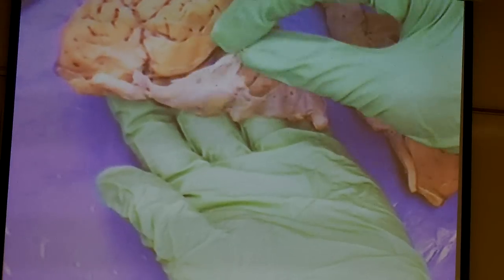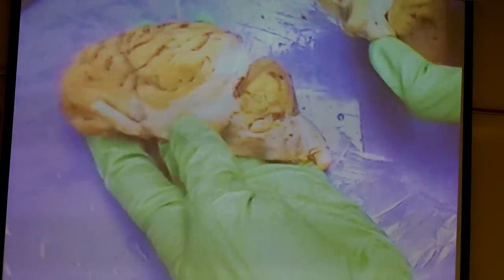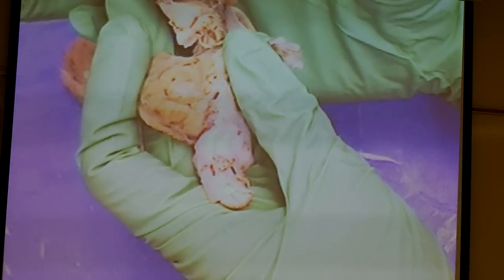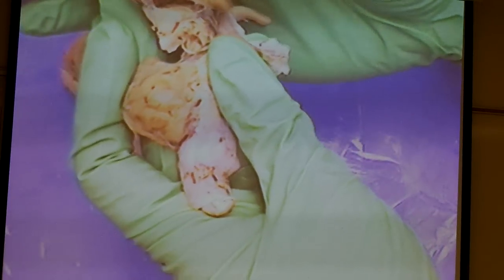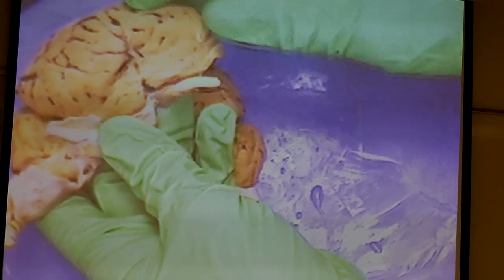What you're seeing here is the dura mater. Tightly adherent on the surface of the brain would be the pia mater. If you pull the midbrain away from the cerebral hemispheres, you might be able to see this cobwebbing in the middle — that's arachnoid. We can't always tag arachnoid in the sheep brain because most of them won't have any left. But certainly the dura mater, and if we put a pin onto the surface of the brain, that pin would be breaking through the pia mater.